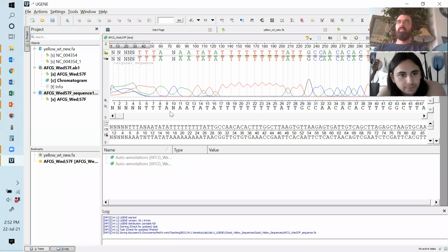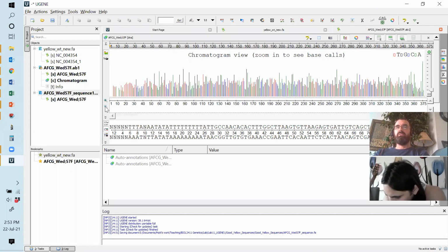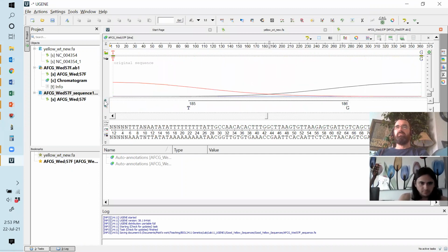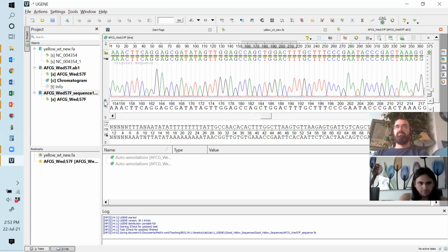How do you change the display of the top where all the lines are, the wavy lines? To make it bigger? Yeah. So you see these tiny little icons down here? You want to use that. So if you zoom out, typically it opens looking like this. Click on the plus icon until you're happy with it. Okay, crikey, can it go even further? Well, that's no use, is it? There you go, that's better.